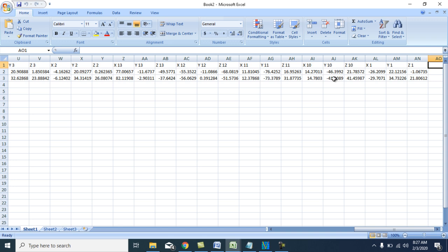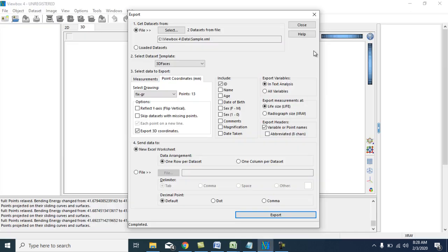So you can save the fixed landmarks, which are the manual landmarks, separately. You can now take the second set, which are the sliding landmarks, separately. But you can also combine them together. Normally you are going to use them together because you want to view them together. But for error assessment purposes, you can separate them. So now go back again. Just leave it like this. Don't worry, you already did that. So just select SL, that's 100.